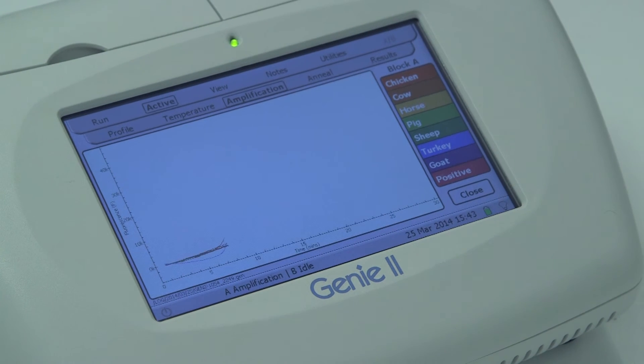At 5 minutes 30 seconds, the amplification can be seen and confirms the positive control has amplified. At 6 minutes, the table shows the result for that sample.